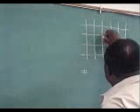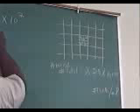And that's what you're after. Some of you will get something like 6 times 10 to the 7. Somebody else may get 2 times 10 to the 6. And somebody else may get 4 times 10 to the 8. But everybody's going to get different numbers after they follow through that.